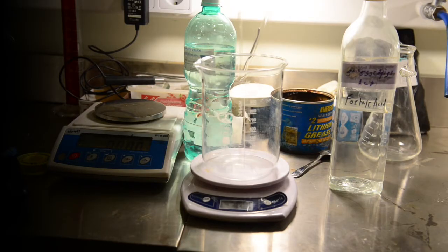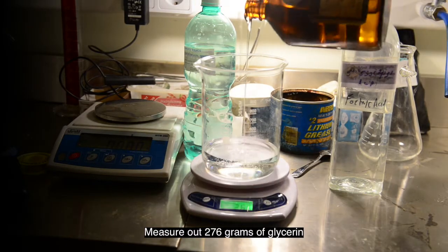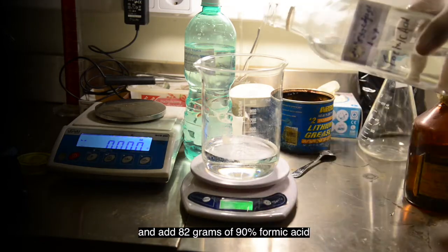To another beaker weight out 276 grams of glycerin, and add 82 grams of 90% formic acid.